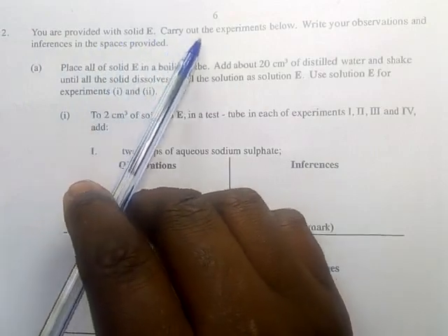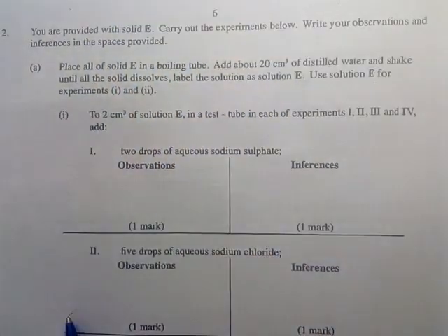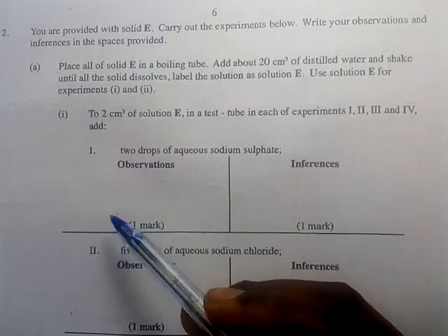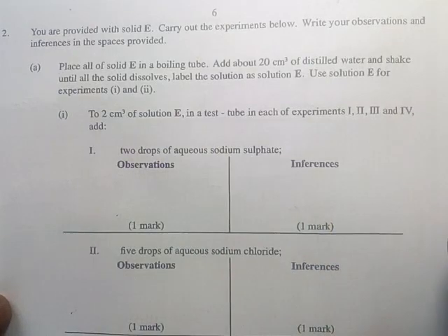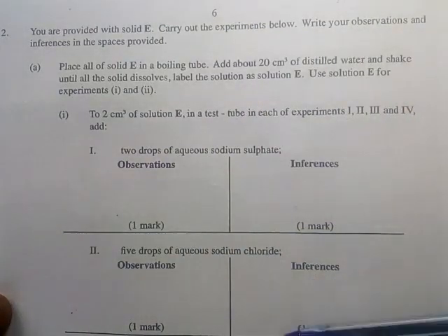Qualitative analysis, 2012, the year 2012. This was question 2. I have skipped the other question because it is a graph question, rate of reaction, which each student should be able to handle. So that's why I just skip it, because the start question of rate of reaction will always vary. But the things we are doing here in qualitative analysis will always be the same.